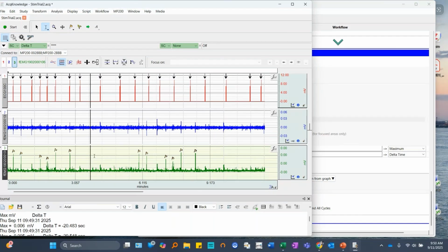So again, that's where I always caution people that as beautiful as workflow can be in terms of saving time, there's always a necessity to put your eyes on the data and actually dig in and just make sure that things are accurate, to ensure that the data being extracted is accurate, because ultimately that's where analysis is going to come from. So with that, we can jump back to Brenda for our last poll and maybe some Q&A.